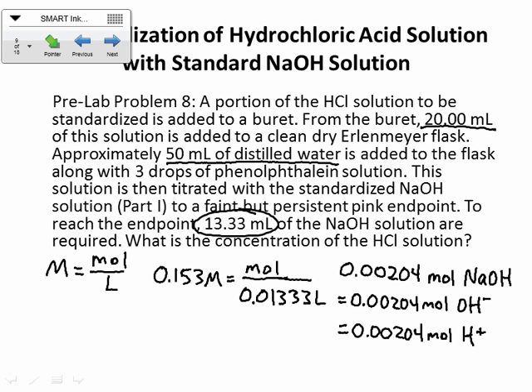Now I've got to think a little bit, because what I really want to find out is what's the concentration of that HCl solution, okay? What's the concentration of the H plus in the HCl solution?